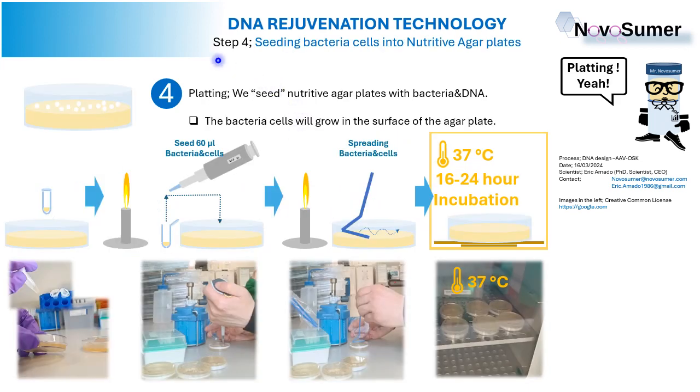We are in step number 4, seeding bacteria cells into nutritive agar plates. We will seed bacteria cells on the surface of these agar plates. This nutritive medium is solid, kind of a gel. In this step number 4, we seed nutritive agar plates with bacteria cells that have the DNA inside. Do you see here?